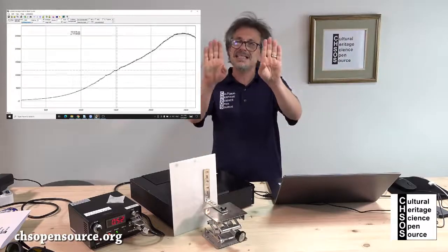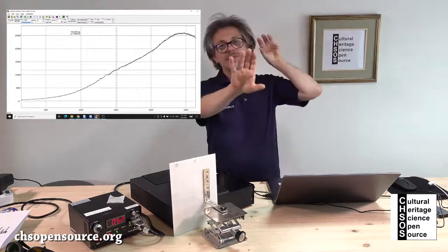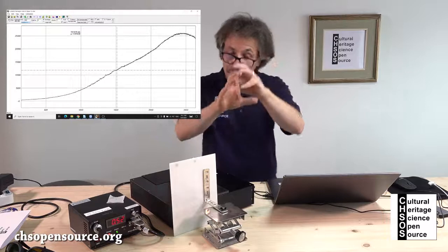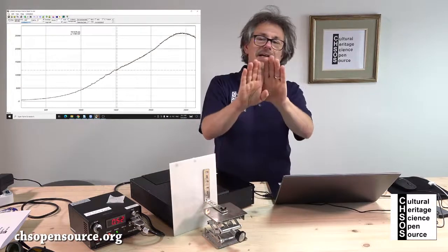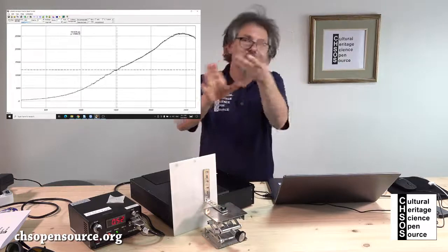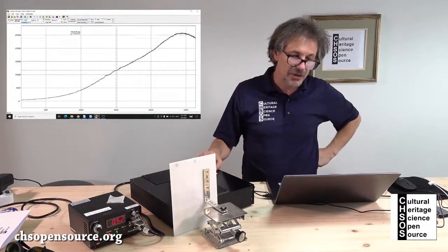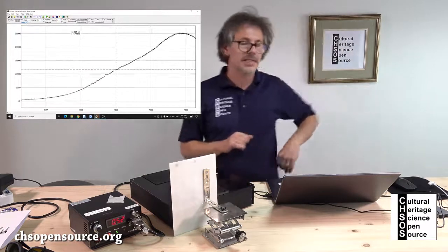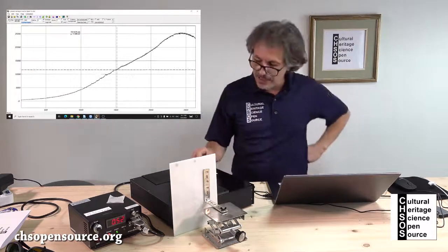Because since the slit is going to be closed, part of the beam of the Raman signal inside the spectrometer will be rejected, cannot go there for mechanical reasons, so nothing special. But what we see now is that the shape of the peaks becomes more clear, so we start to see them better defined.